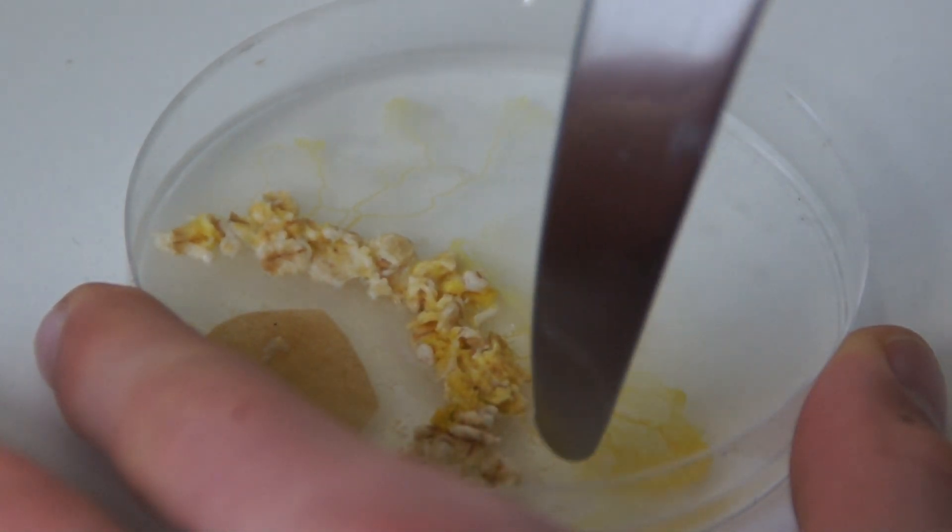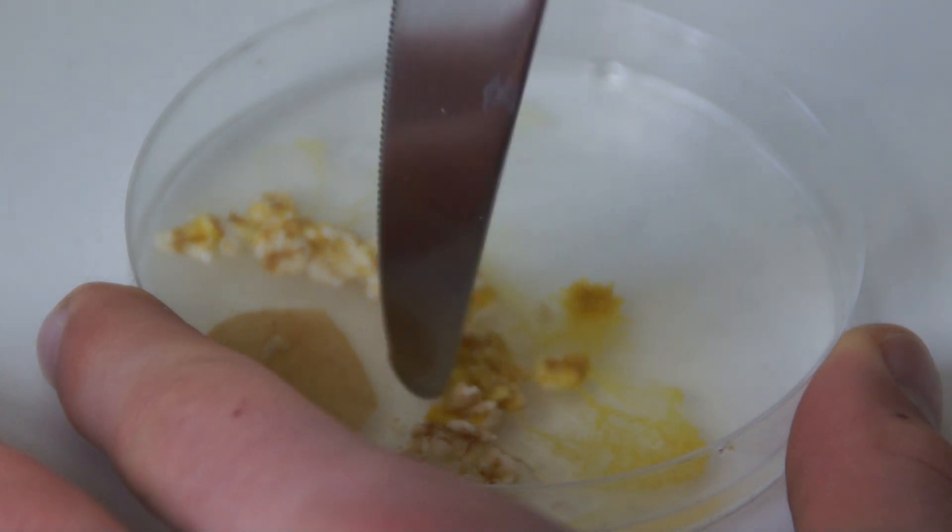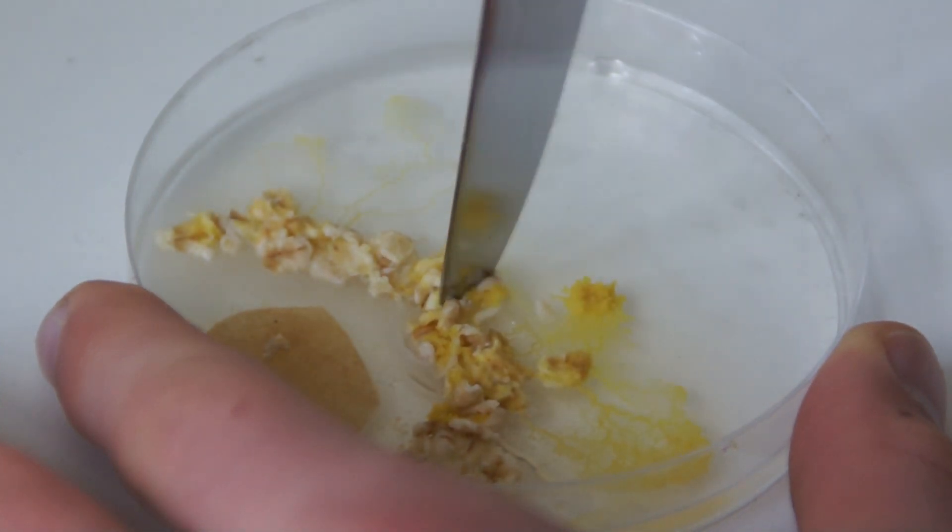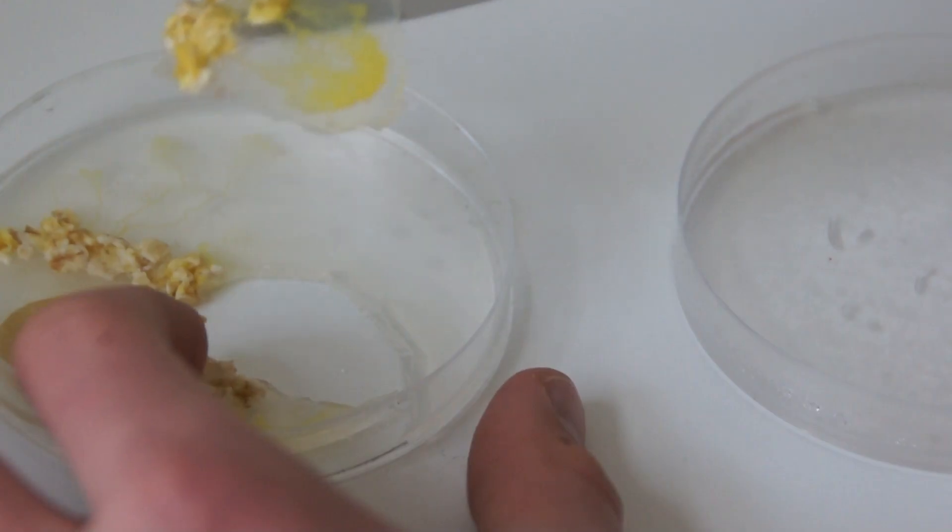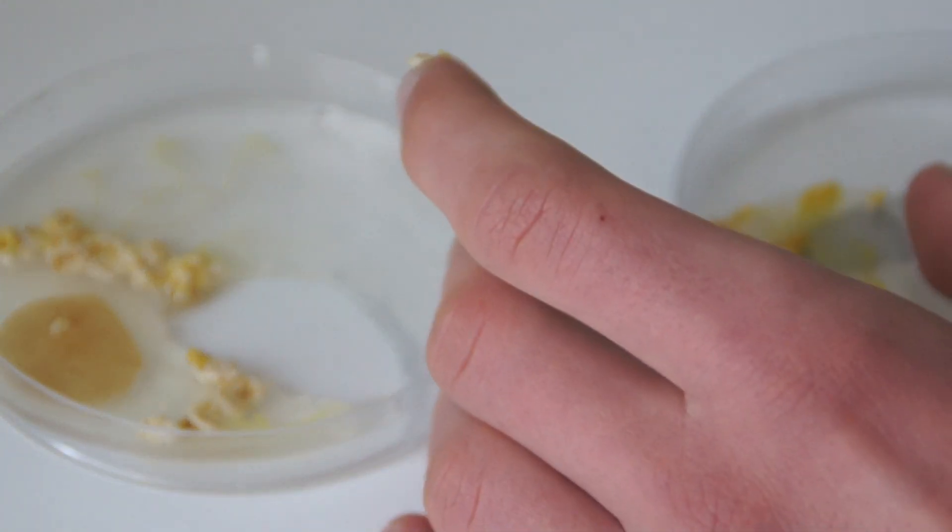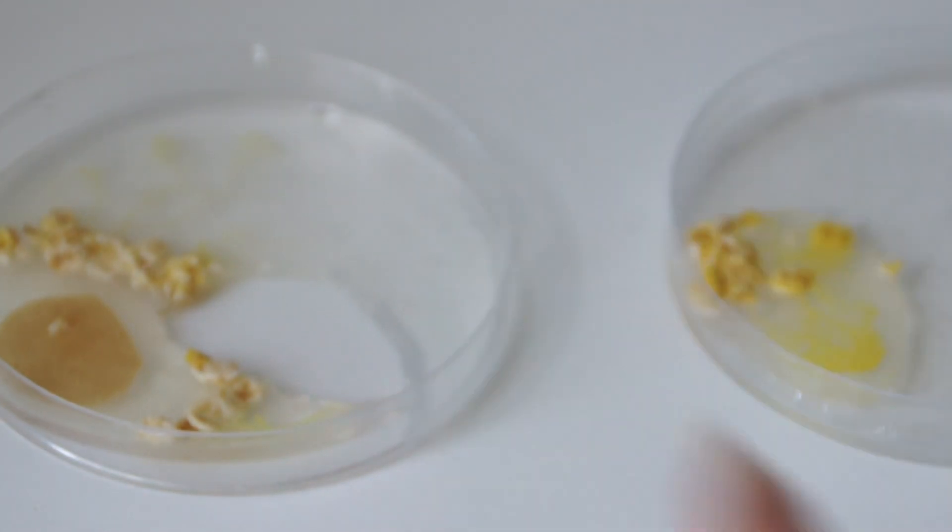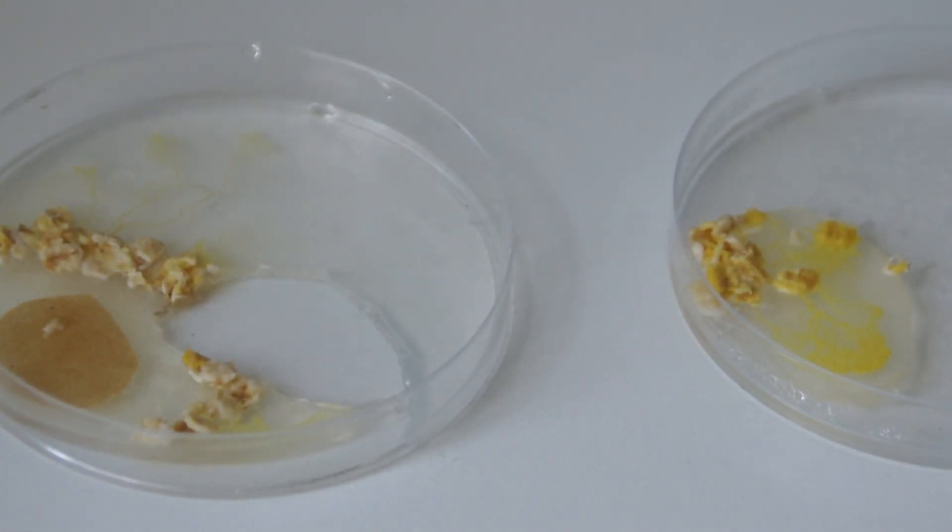Once your blob has moved after about 24 hours, cut around it like so. Transfer it onto a new plate and place some oat flakes like previously.